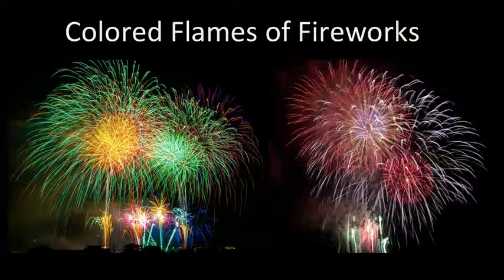Have you ever wondered how fireworks manufacturers create the different colors of lights in the sky? The answer, of course, lies in chemistry. Let's conduct demonstrations in a controlled environment to look more closely at differences between the colors of light emitted from the elements as they burn.